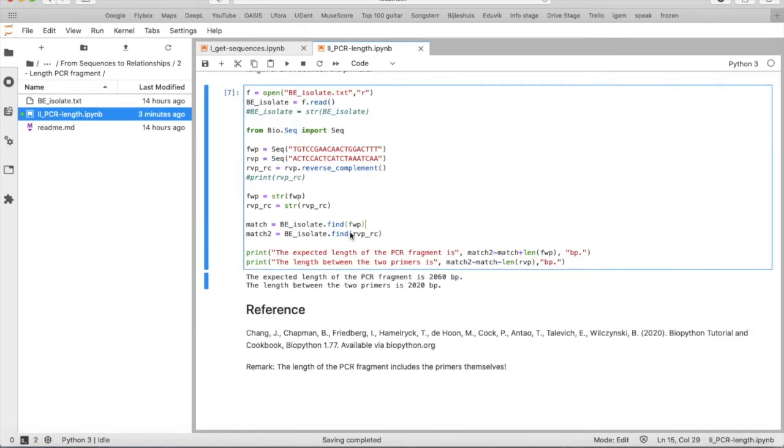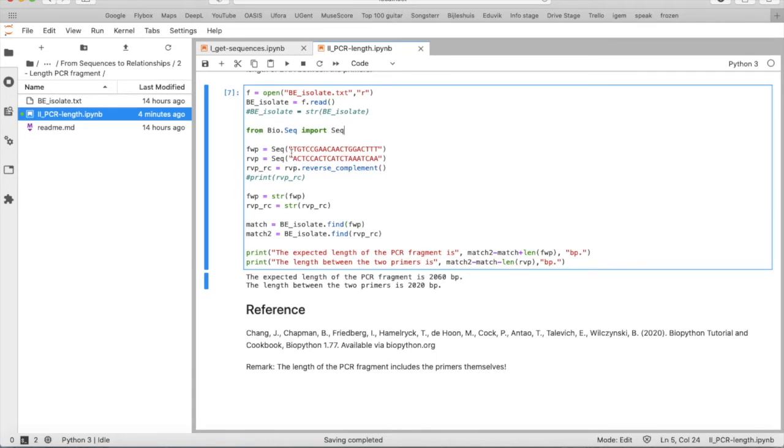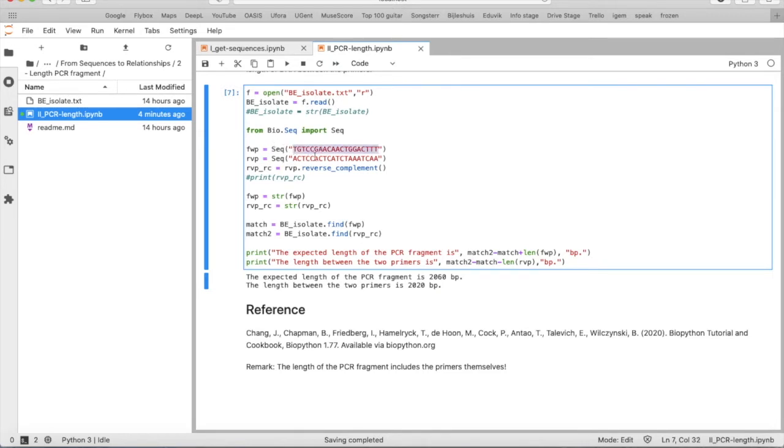Okay, so now we have to import both sequences of the primers into the script. That we will do using the Seq command. So we say from Bio.Seq import Seq. And then we will put both primer sequences into the script by using Seq, and then the sequence of the reverse and the forward primers into the Seq object.